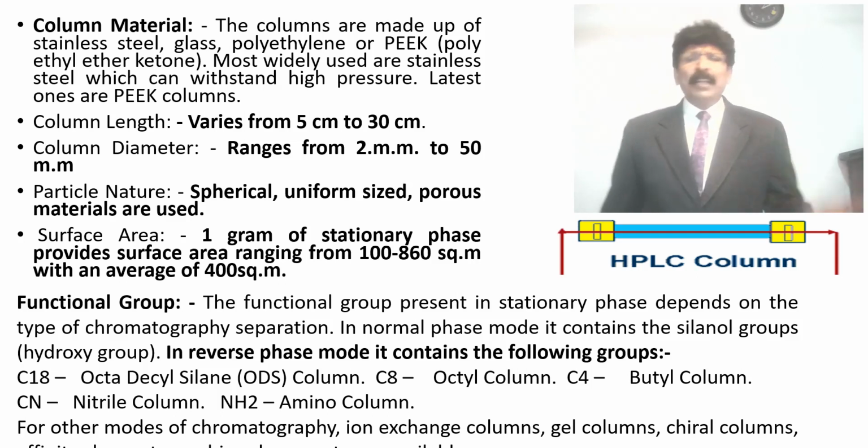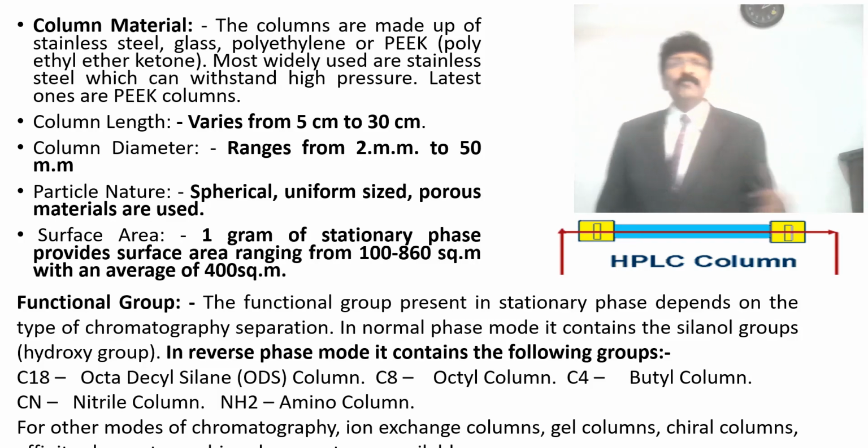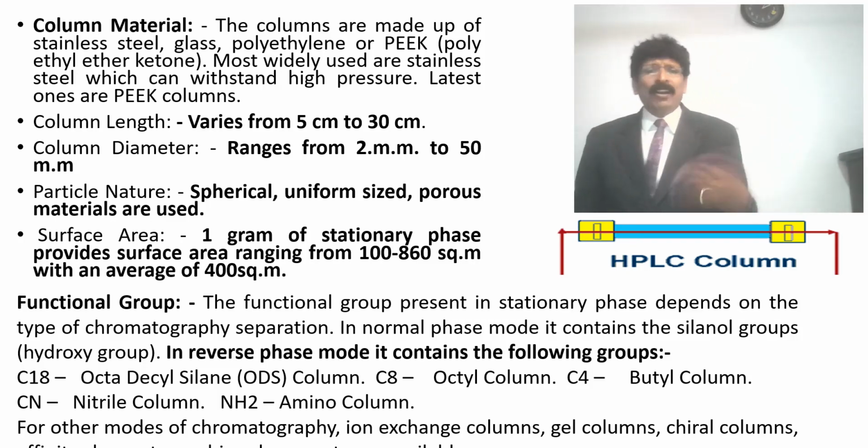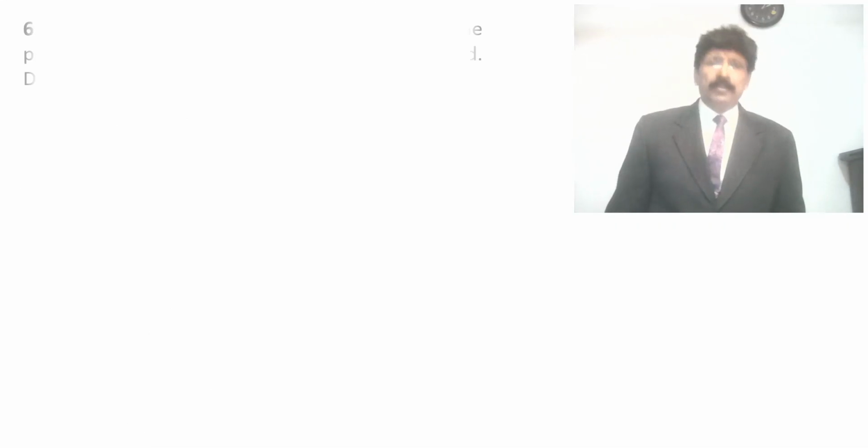For other modes of chromatography, resins, ion exchange columns, gel columns, chiral columns, affinity columns, etc. There are many new columns also available.